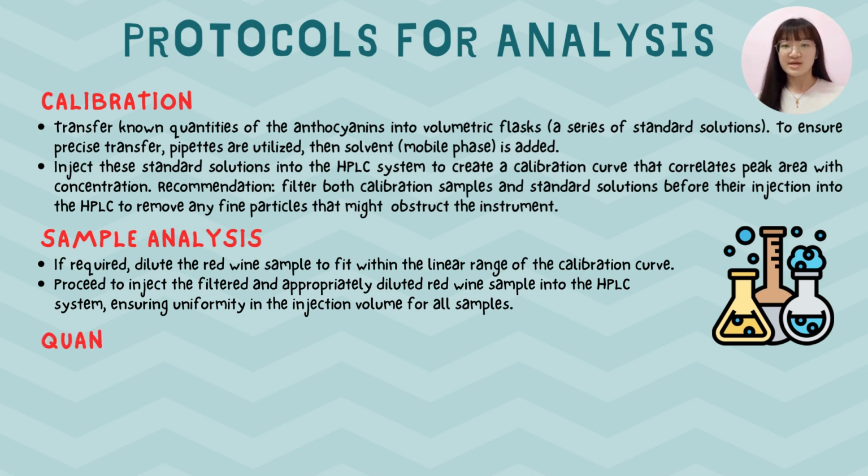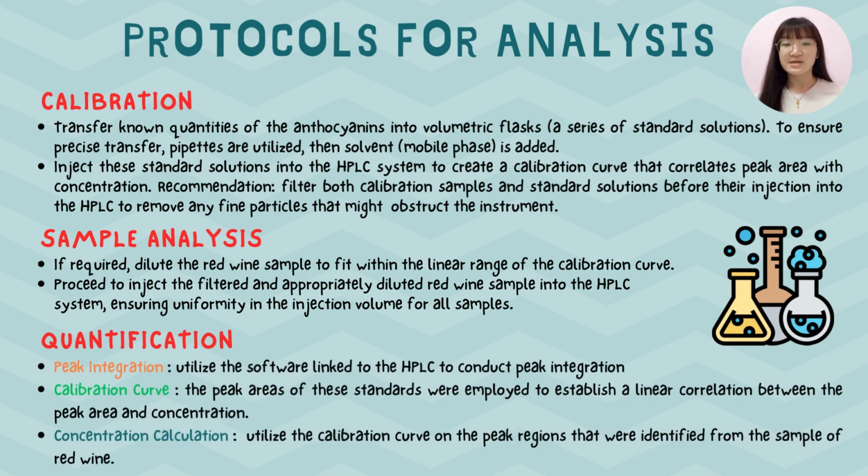Lastly, the final protocol is quantification. There are three parts in quantification. The first part is peak integration. Following the completion of the HPLC analysis, utilize the software linked to the HPLC to conduct peak integration. This process entails recognizing and measuring the area under each peak in a chromatogram that corresponds to specific anthocyanins.